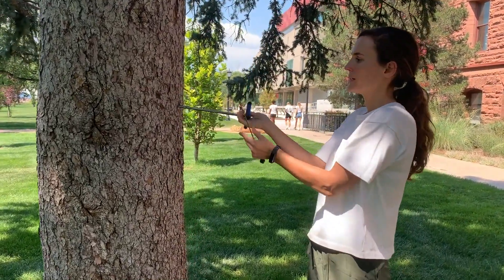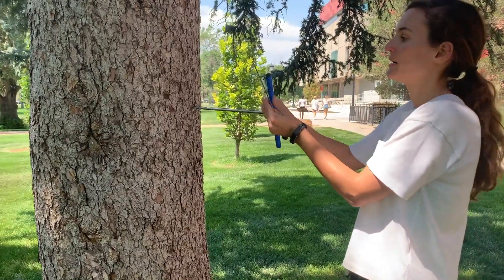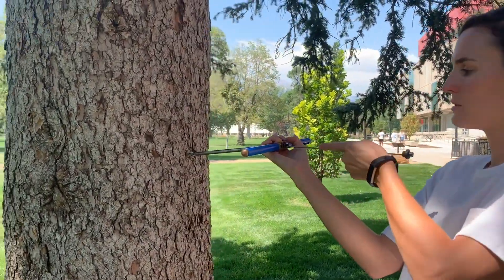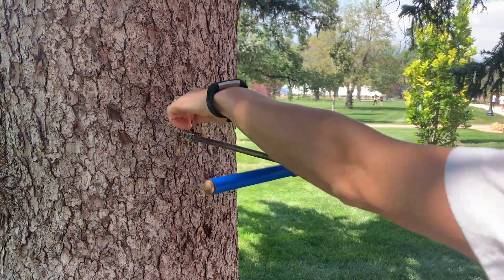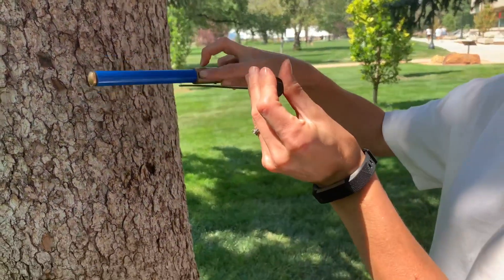I'm not going to do it here, but if I were going to, I would just apply pressure and turn this until you get into the tree. Then once this is in, you use the spoon to go in and turn it 360 degrees to break the core off at the end, and then you would take your core out and it would be right here.